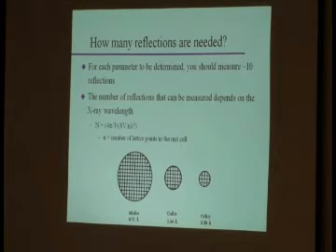The larger your real space lattice constants, the closer together the points are in reciprocal space. So the larger the volume, the more reflections you can measure. Divided by n, where n is the number of lattice points in the unit cell, and lambda cubed. So the wavelength has a very big contribution to this. It goes in to the power 3. Okay.